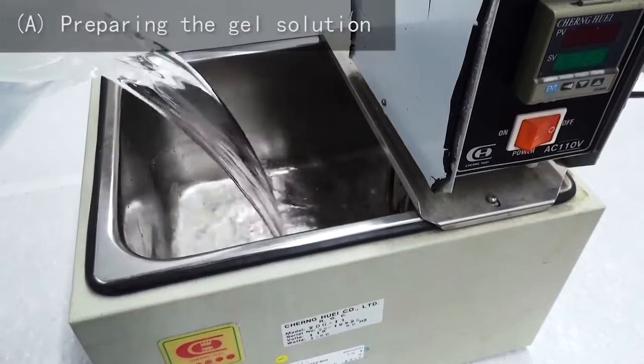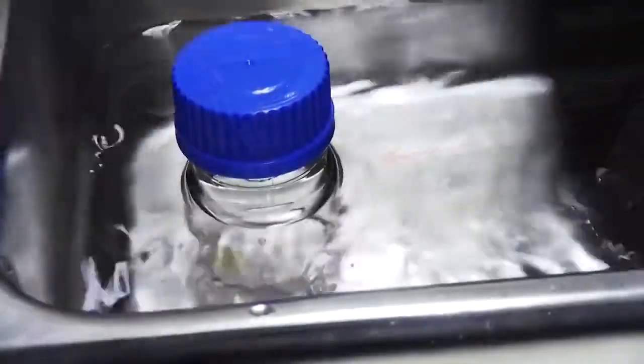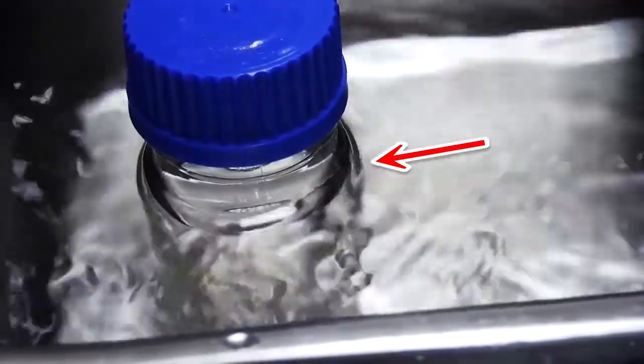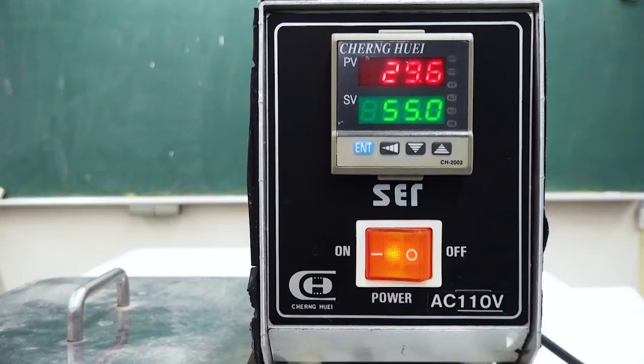First, switch on the water bath and add enough water so the water level will be higher than the gel solution level. Set the water bath temperature to 55 degrees Celsius.